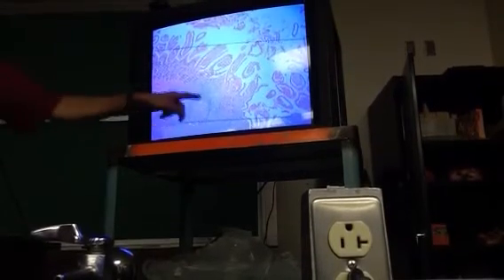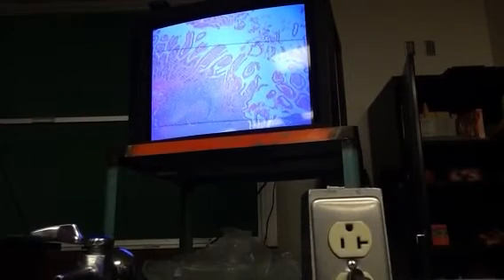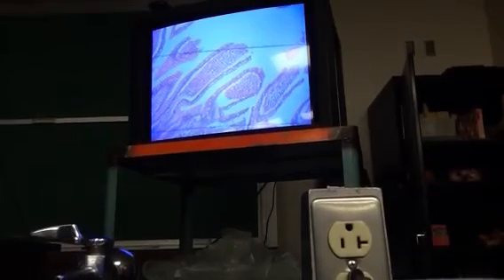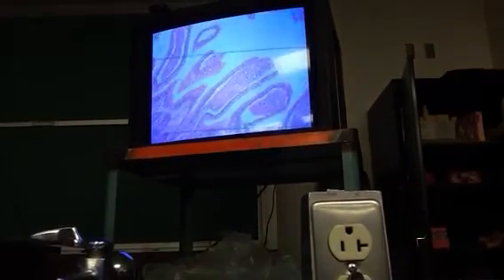You can see germinal centers in them. That's where immune responses are going on. To see the goblet cells, you'd have to be on higher magnification. We want to be at least at low power, and best seen perhaps at high dry. There's high dry. You can see them. There's your goblet cells.